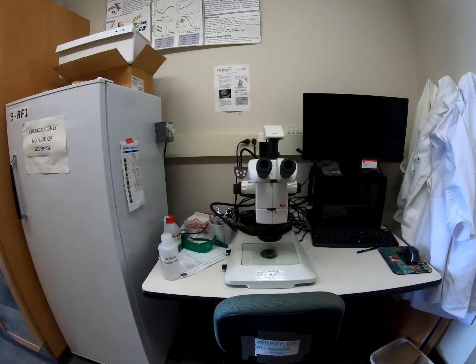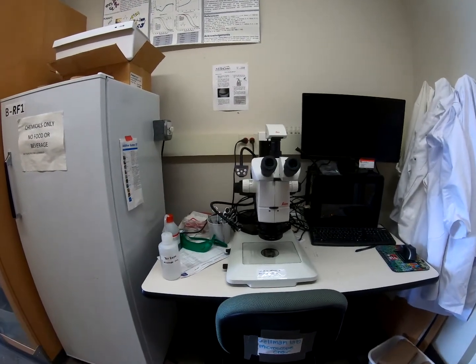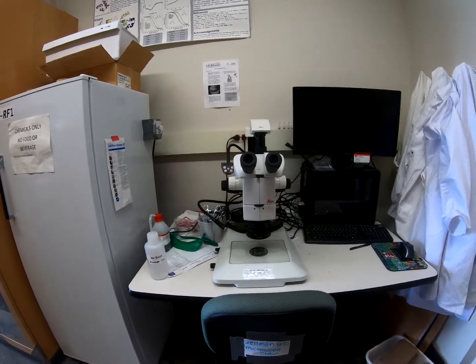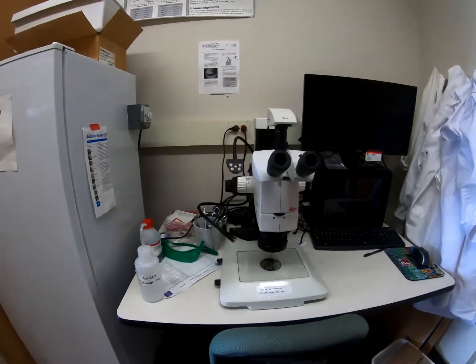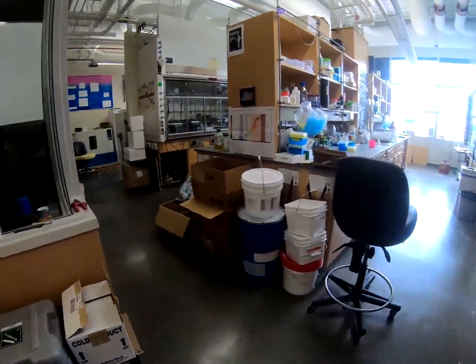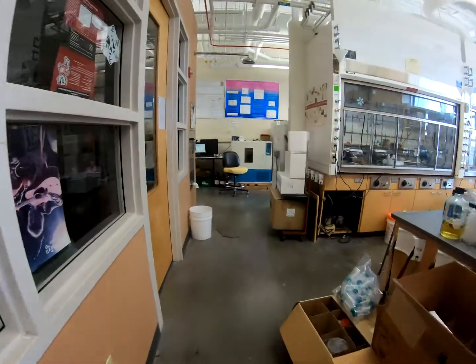This is primarily used by the crystallography team just to assess, measure, and analyze crystal growth as we're growing up our crystals. All right, and I'll see you guys in Lab C in a moment in the next part of the video, for the next part of the tour.